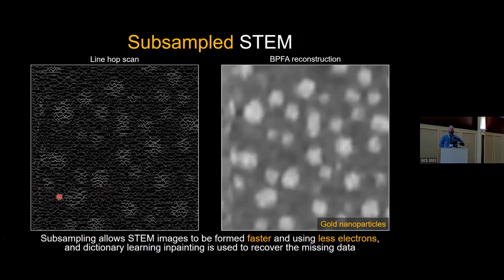So obviously we're talking about compressive sensing here, and all of the problems that have been mentioned so far only get worse when you start talking about subsampling, because all of a sudden you have non-regular scans generally. They're not well structured, or they can be structured, obviously, depending on your application. But for us, we try to use non-structured scans.